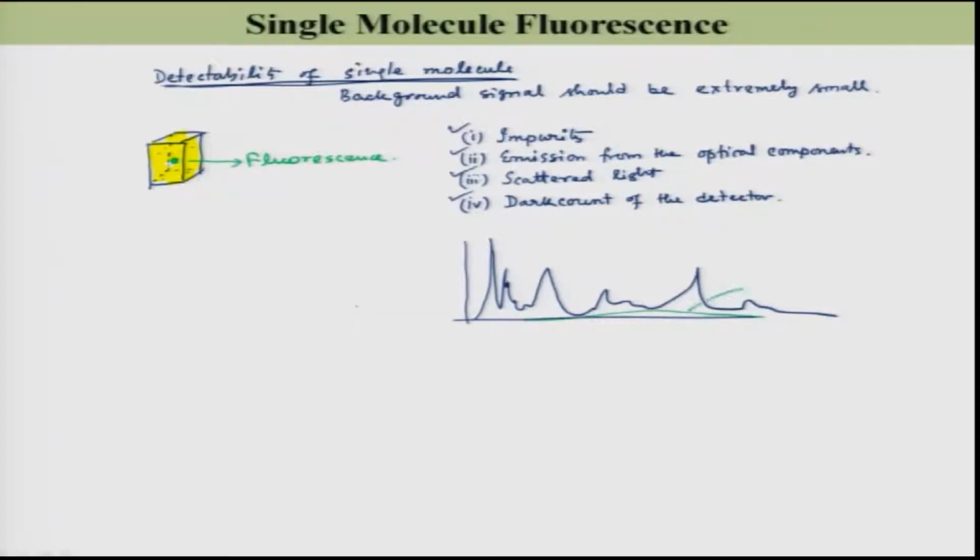This fluorescence is coming from your molecule, that means your fluorophore. And this Raman scattering is coming from your solvent.